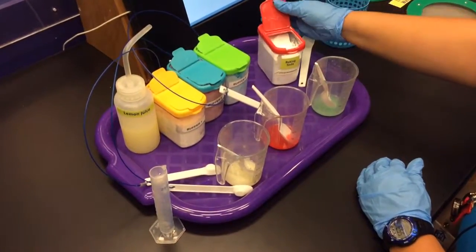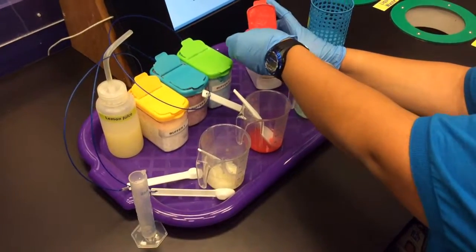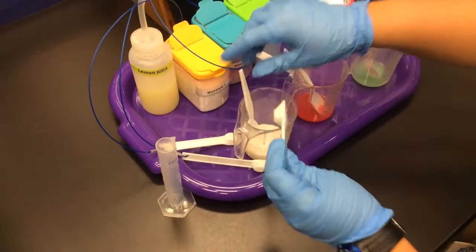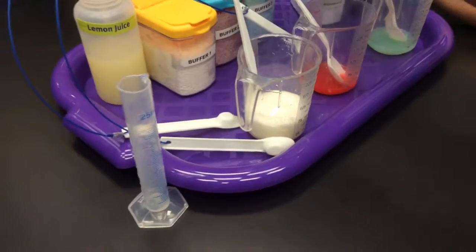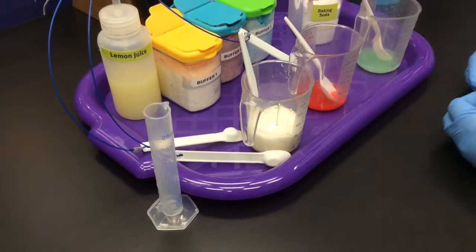So we're going to open that up, and we're going to add it starting from our first one to our last, and we're going to see what happens. So first, let's pause. We're just going to take a look at this first one. The first one, we already see there's a reaction, right?